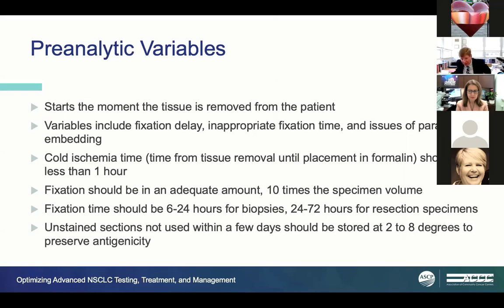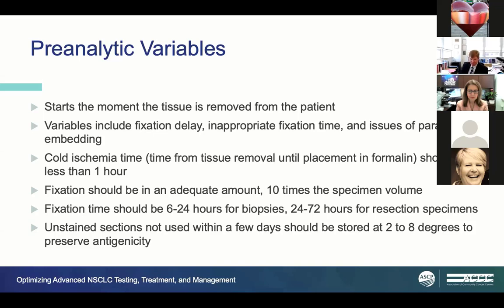What are the pre-analytical variables for immunohistochemical staining? It starts the moment tissue is removed from the patient—oxygenation to that tissue is gone. Is fixation delayed? Is it fixed in the wrong solution? Is the tissue embedded in paraffin correctly? The cold ischemia time—from removal to placement in formalin—should be less than an hour. The tissue must be fixed appropriately, with about 10 times the specimen volume in 10% formalin.